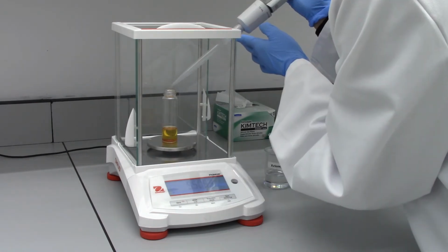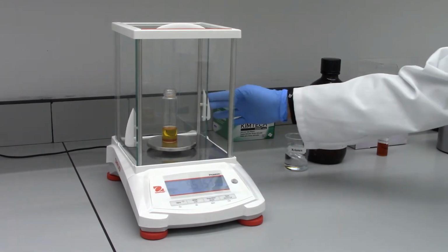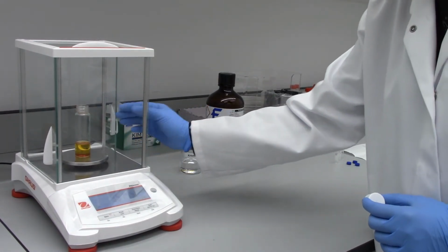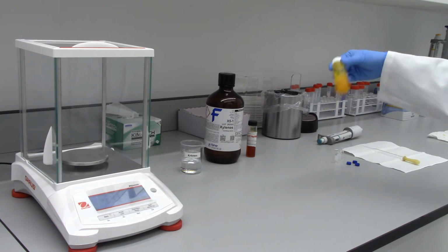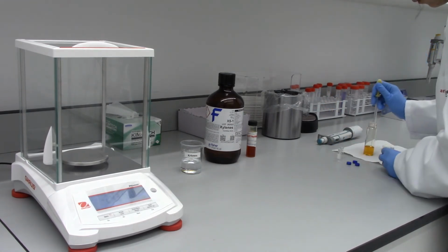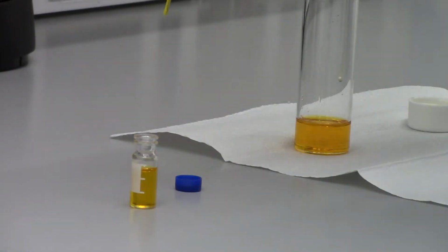Samples are diluted by weight. Here we use xylene as a diluent, and later we will enter the accurate weights of the samples and the diluent into the analyzer software to account for the dilution factor in the results calculation. It's important to thoroughly mix the sample dilutions to make sure they are absolutely homogeneous before we fill them into the autosampler vials.